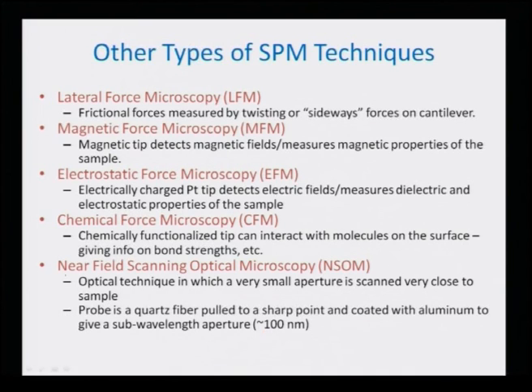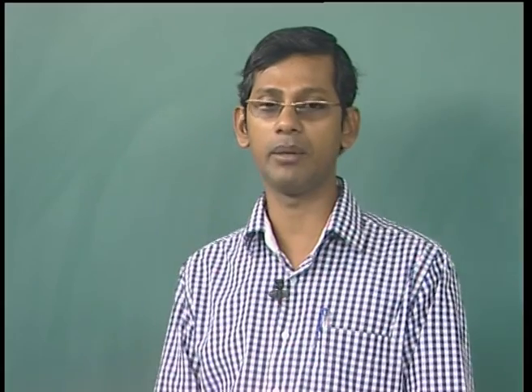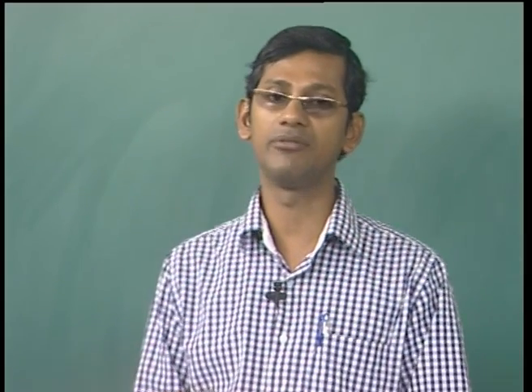And I just discussed the near field optical microscopy. I discussed one of the techniques, like laser confocal. There are many others available. So, in this technique also, it is a probe technique in which small apertures are scanned very close to the sample, and the probe is a quartz fiber, a major discovery made in 1991, pulled to a sharp point and coated with aluminum or silver to give a sub-wavelength aperture. And there are many such interesting applications for each of the techniques available, which one can actually get from literature.